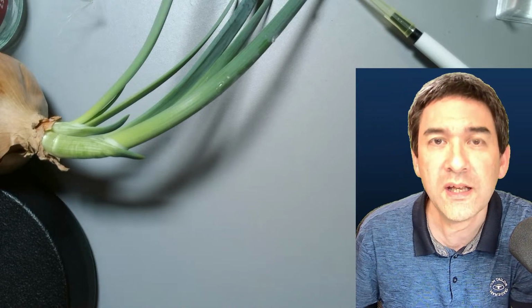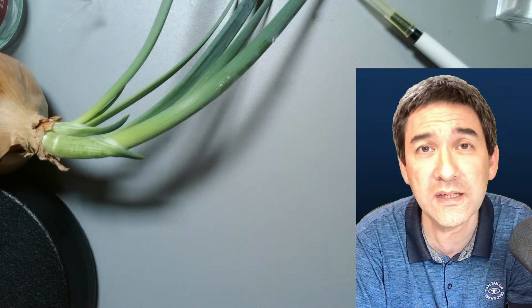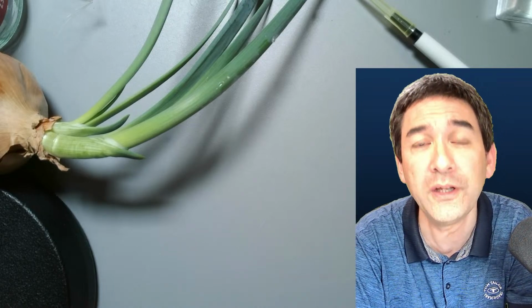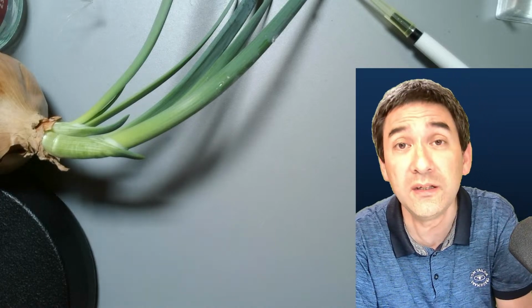Is there an adapter that I can put on my microscope so that I can take pictures with my phone? Yes, there are cheap mobile phone adapters. Basically, these adapters will simply hold the mobile phone in front of your eyepiece. So you're just taking pictures through your eyepieces, and sometimes the quality is surprisingly good. So that is indeed, I would say, the lowest cost option.